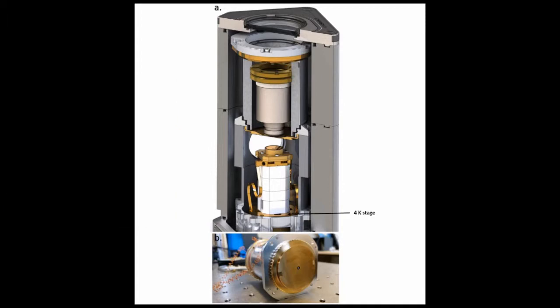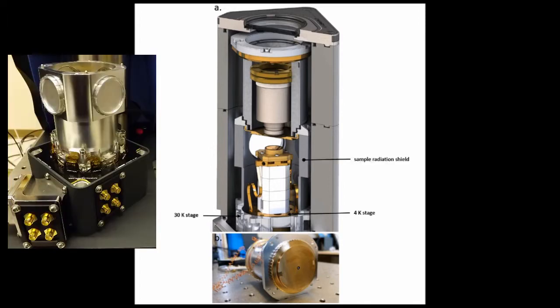The 4K stage mounting region sits within the 30K stage. The sample's radiation shield is supported rigidly and thermally connected to the 30K stage. The radiation shield thermally protects the sample and helps overall temperature stability by lagging wires, fibers, and other loads that may cause heating.